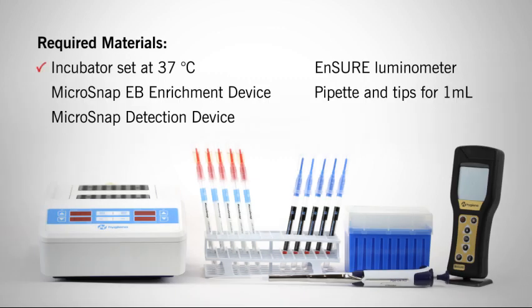The materials you will need include a dry block incubator capable of 37 degrees Celsius, a Microsnap EB enrichment device, detection device, the Ensure luminometer, a pipette and tips for 1 milliliter, and all required materials for product sample preparation.